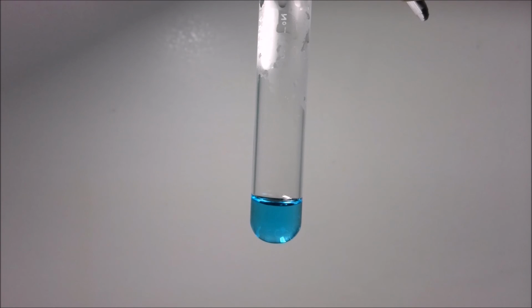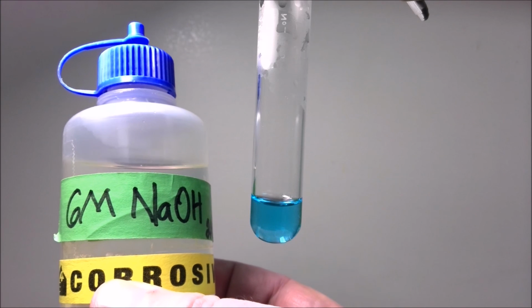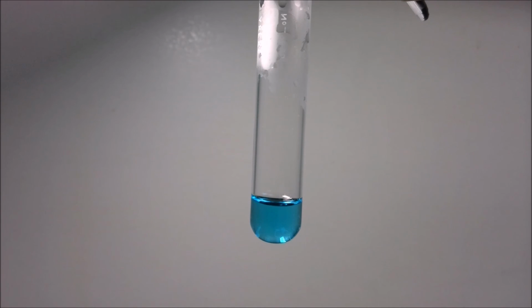is to precipitate out our dissolved copper by reacting with 6 molar sodium hydroxide. We start by adding approximately 10 drops of sodium hydroxide, and we see a solid starting to form. When we mix it up, however, that solid actually redissolves, indicating there must be something in the solution that is reacting with the copper hydroxide, causing it to redissolve.